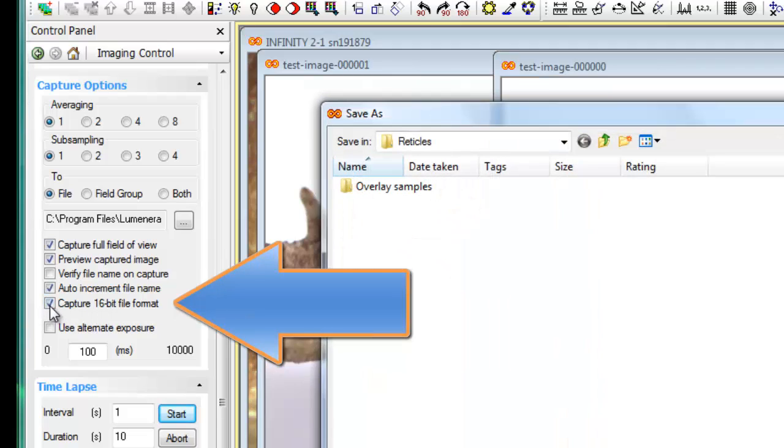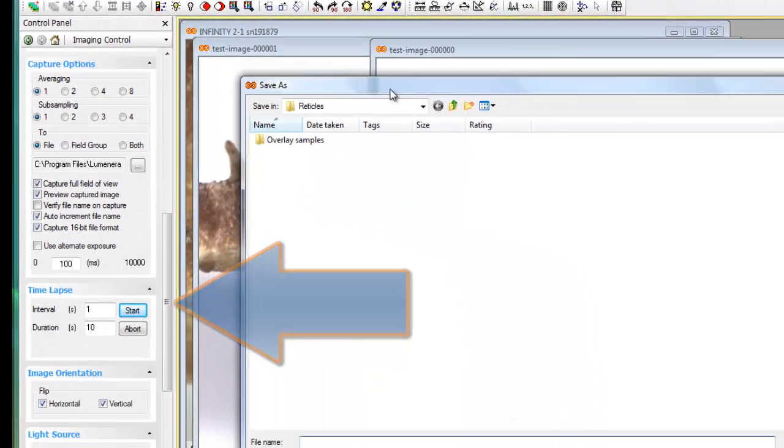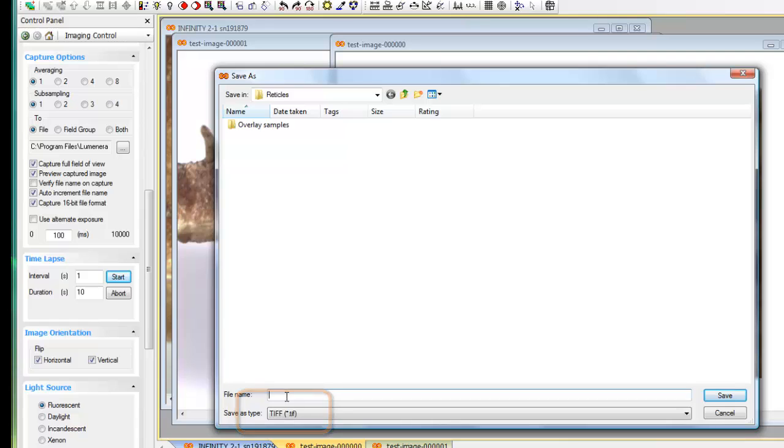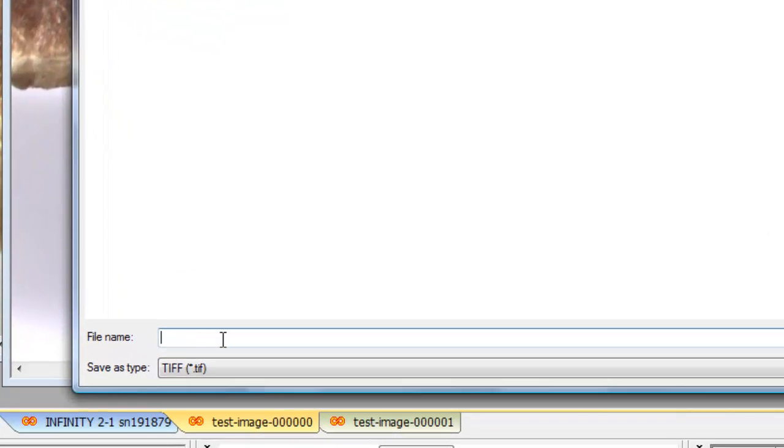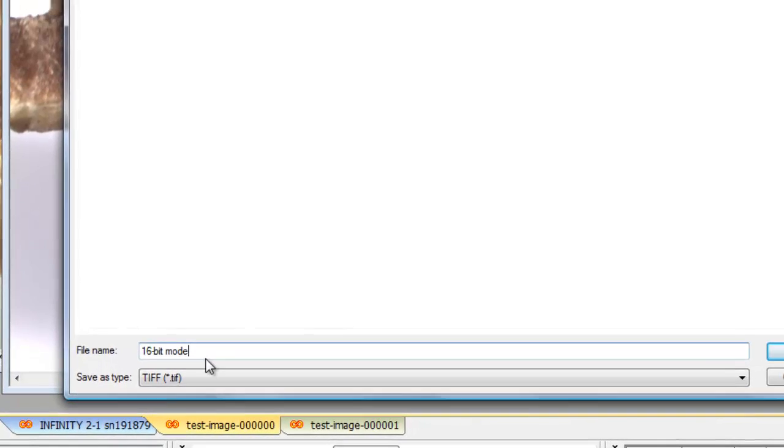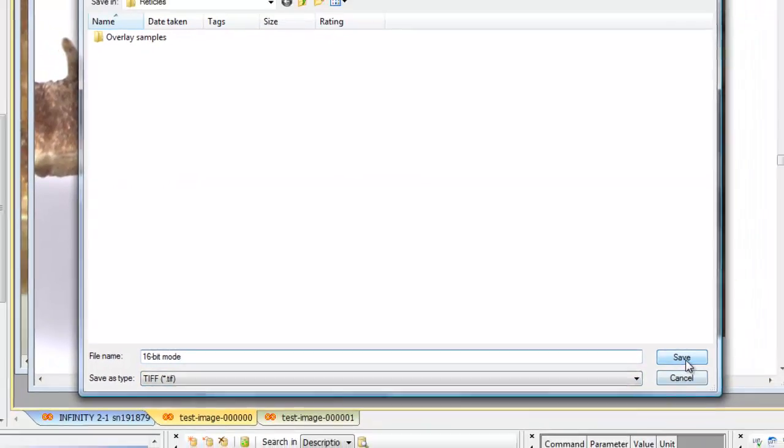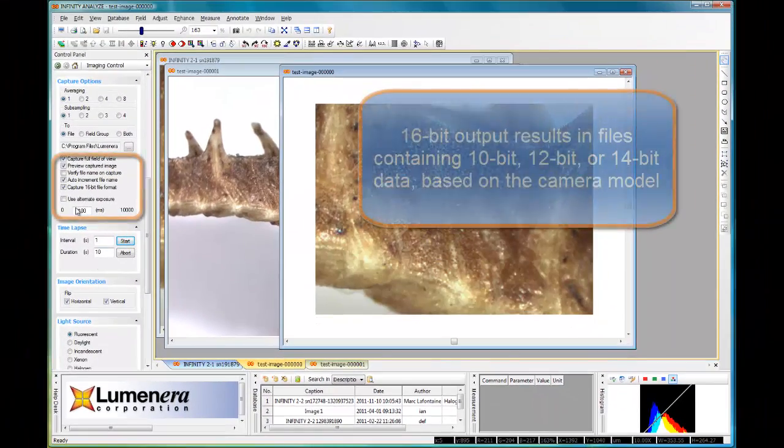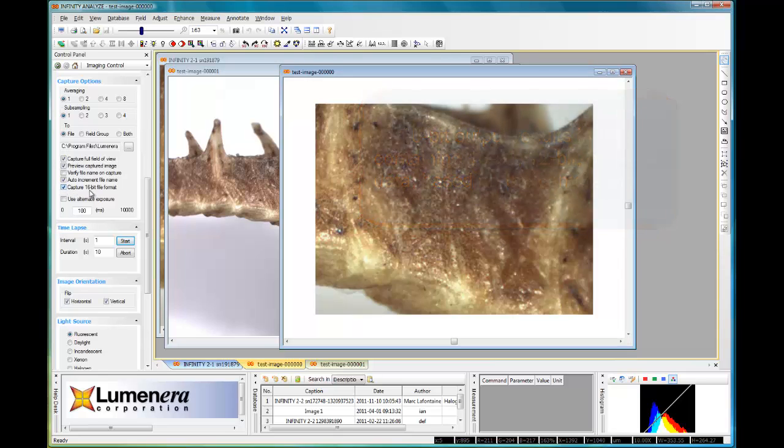Capture 16-bit file format. This will pop up a dialog forcing me to select the TIFF output as the file type and I can specify my image file name here for 16-bit mode and it will save it always in a TIFF file format. The reason for that is the TIFF file format is the only one that can support the 10, 12, or 14-bit output from the different camera models that we have.